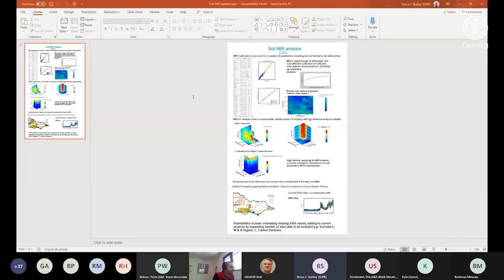Handheld, much more limited range of calibrations that we've got in that. This is actually off a presentation I did for a farmer day. So the predictive value is actually for a local soil and pretty meaningless for this. Handheld versus laboratory MIR.